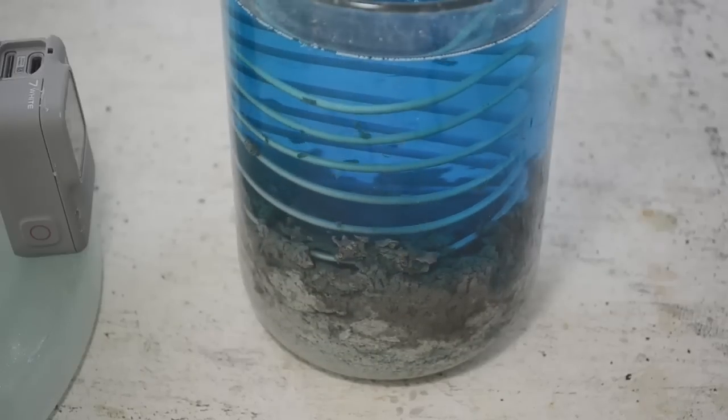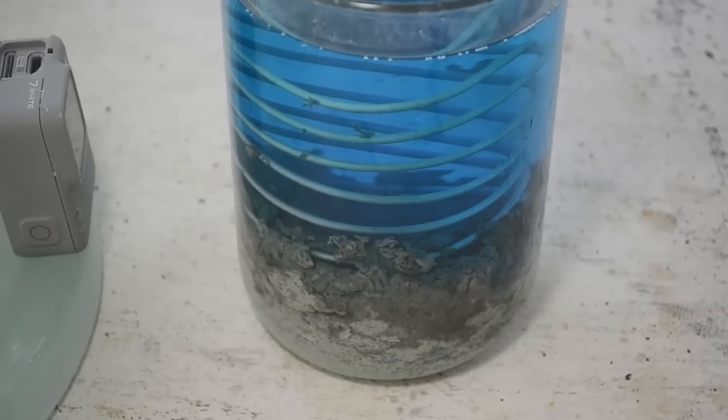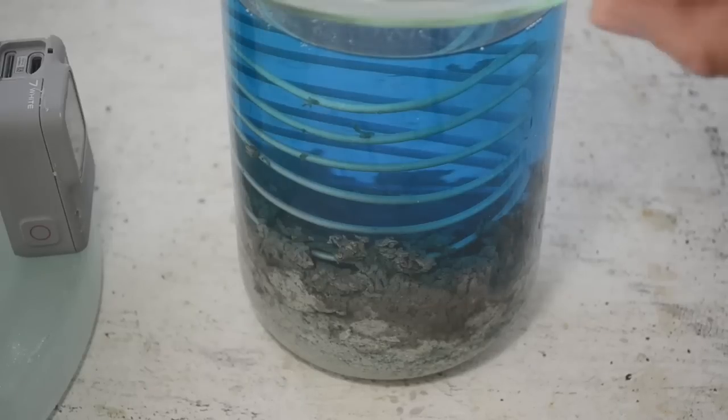Look at how much silver is in the bottom of that beaker. Wow. But I knew this was a fairly concentrated solution, so got to get a lot of silver out of it. So I'm just going to stash this in the back of the fume hood and leave it until tomorrow and see what we get out of it. And see what it looks like then, okay?